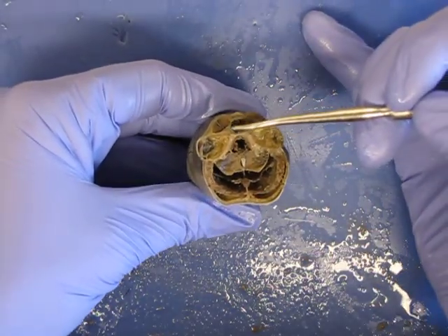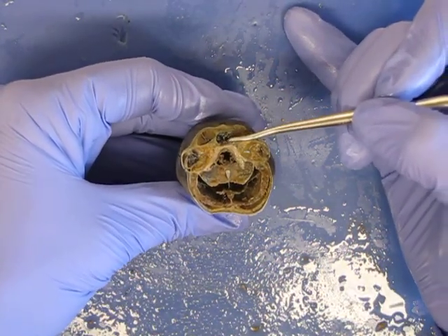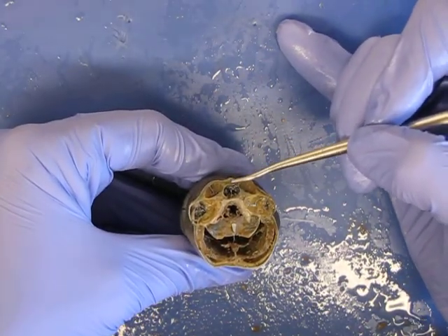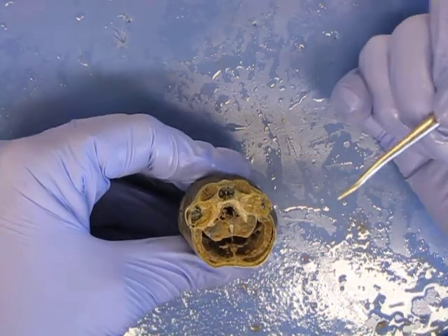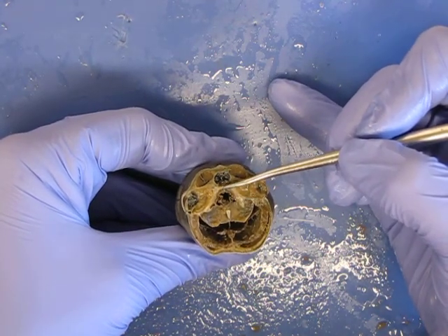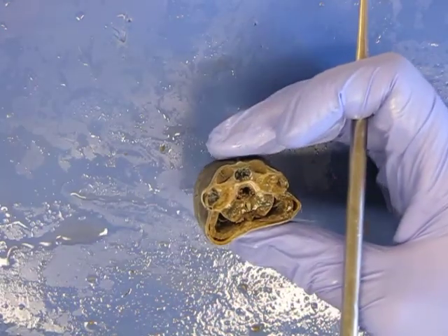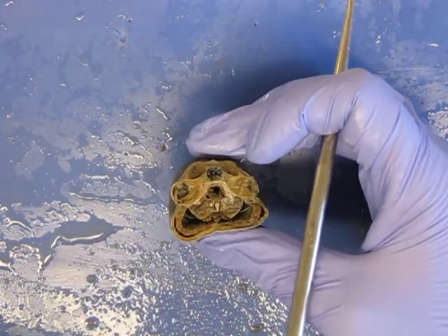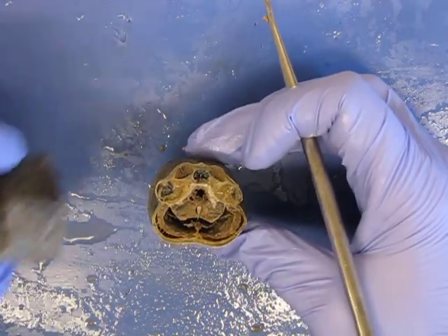The dark area here, that is the olfactory sac. You just start to see the light section right there, which is the pineal complex. Now underneath, ventral to the olfactory sac, you should be able to see the hypophyseal pouch that helps move the water in and out of the olfactory sac. If you don't see it immediately, check the next section.